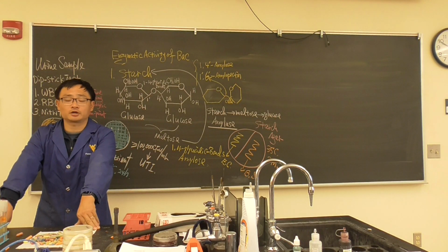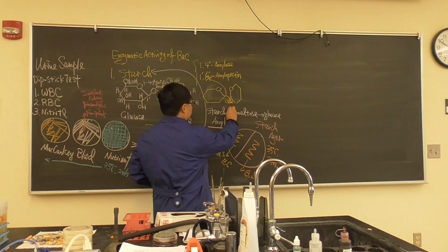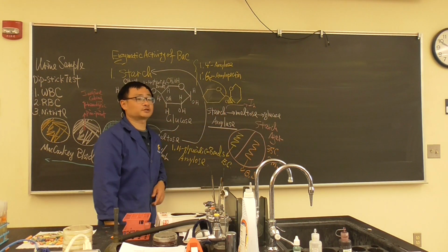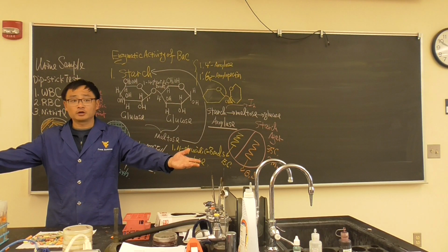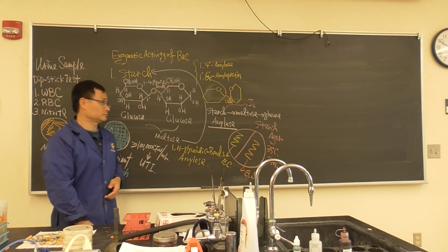Another organic chemistry question. How do you know? Which chemical will starch react with? Is that right? We'll react it with iodine. Where did we use the iodine before? In the gram stain. So we can use gram iodine.